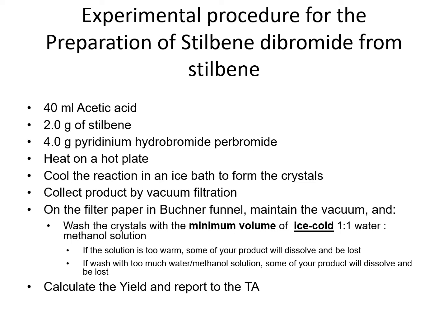Here it's also recommended that you use the Buchner funnel, because if you try to wash the crystals using a normal funnel, they may get washed out because the water will wash around the tip, around the mouth of the funnel.